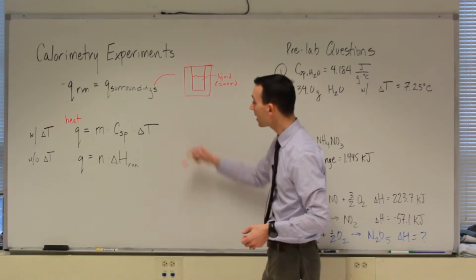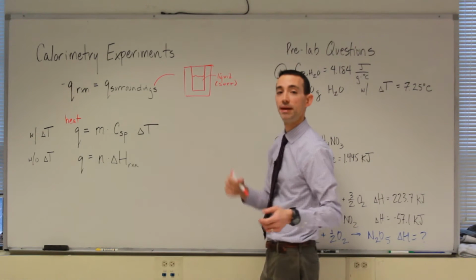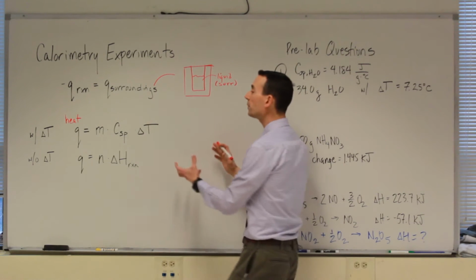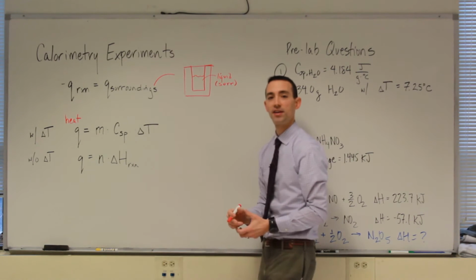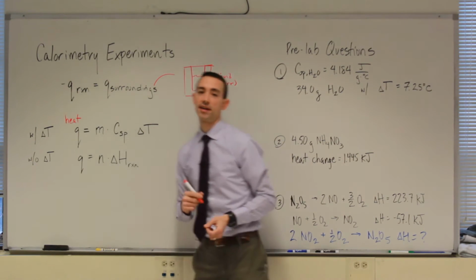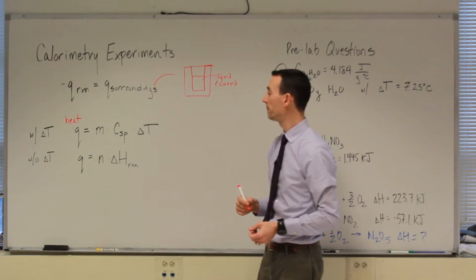All right? And then we'll use a thermometer to measure the change in temperature. Pretty straightforward. So that will tell us the total amount of energy gained by our surroundings and thus released by our chemical reaction. All right?